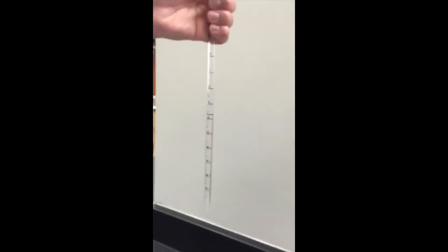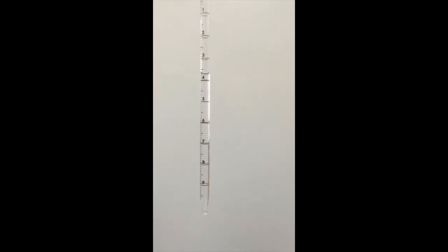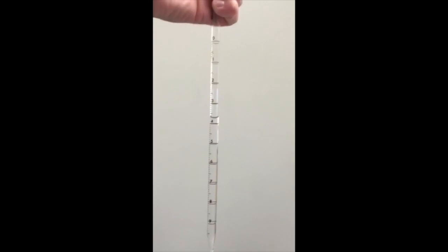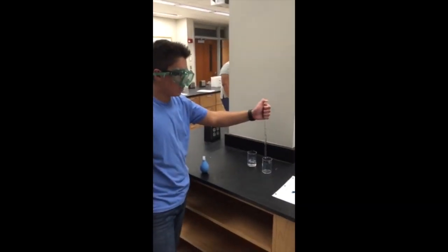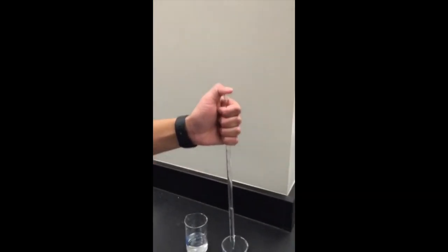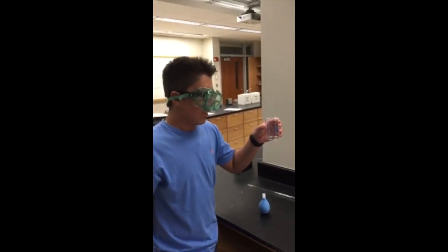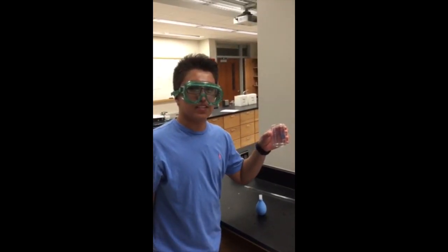Right now, I have about 3.79. I'll release the top of the pipette into an empty flask to find our final volume. And here we have about 5.95. And now, after subtracting the final volume minus the initial volume, I get 2.16 as my amount delivered.